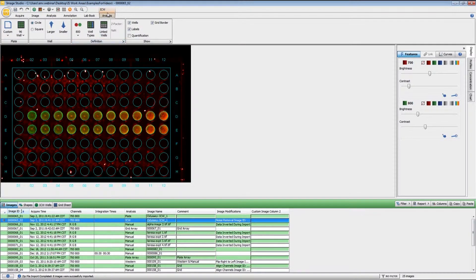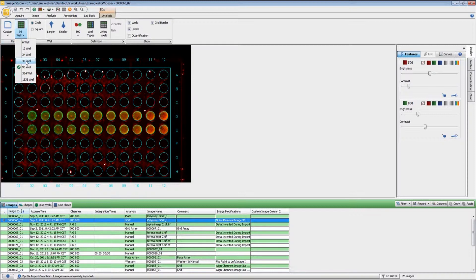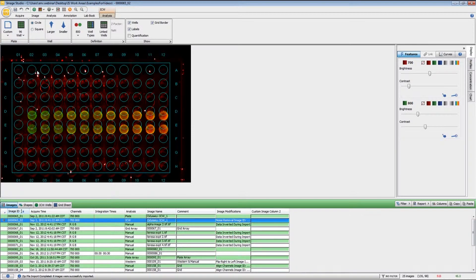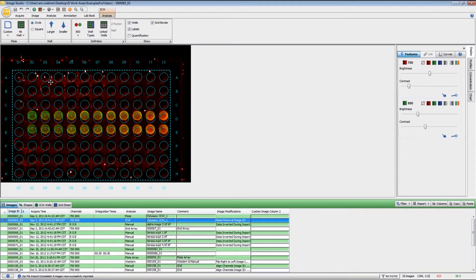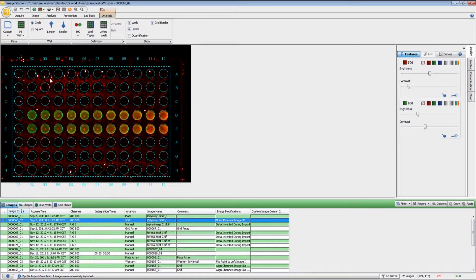You'll see that there is a new ribbon that comes up to the side. Here, if we start in the plate group, we can choose whatever type of plate that we have. So if you use, say for instance, a 24-well plate, you can set that and the 24-well plate analysis is applied. But in this particular case, we do have a 96-well plate, and if I click there, I can then move the plate into the correct location.